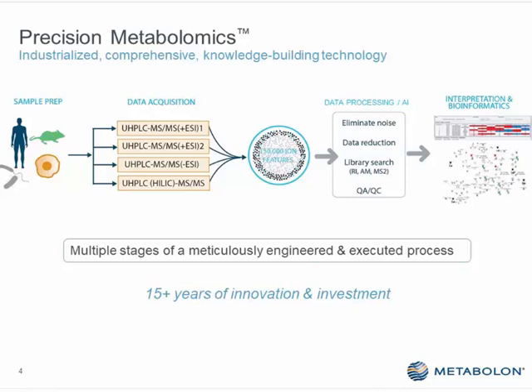We've also developed software that can look for and QC which platform, which method, is going to measure that small molecule, and then perform the final data set QC. At the end of the day, in 100 microliters of blood, we typically measure around 1,000 biochemicals, both identifying and quantifying them for the groups that we work with. We can take that even further and perform a biochemical interpretation or data analysis, and report back not just the raw data, but also the biostatistics and the biochemical interpretation of that data.